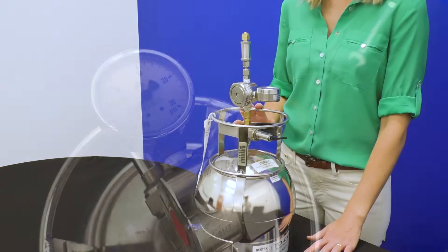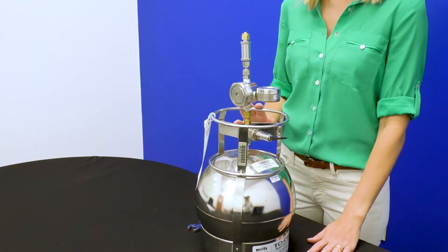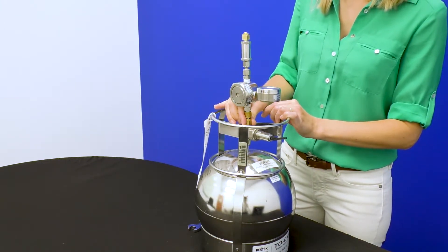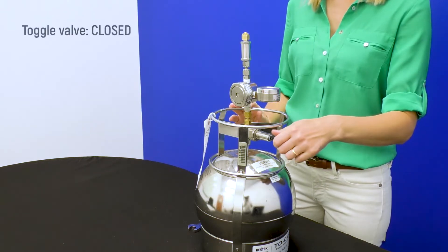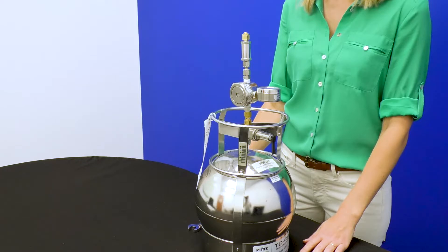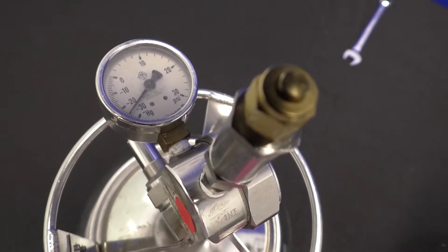If you hear hissing or see the gauge pressure dropping quickly, close the valve promptly and check fittings to ensure they are snug. Then flip the toggle valve or turn the rotary valve back to the closed position. With the brass cap secure and the valve closed, the flow controller should hold the vacuum as originally documented.